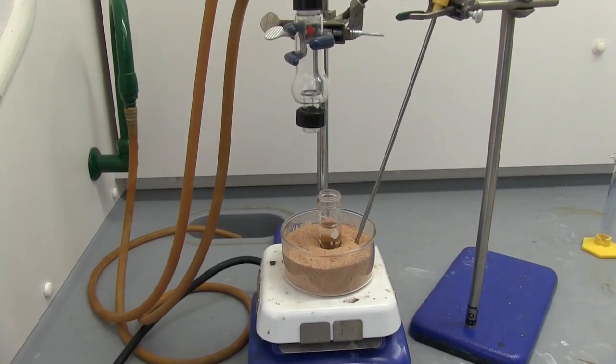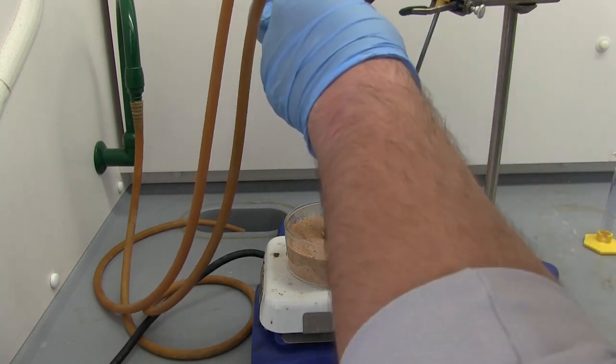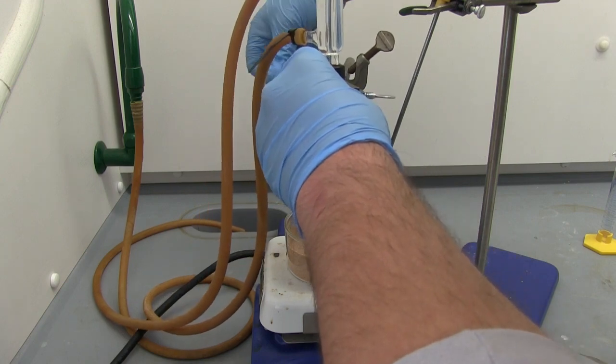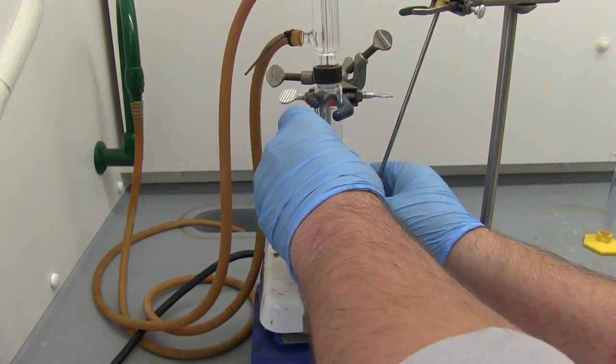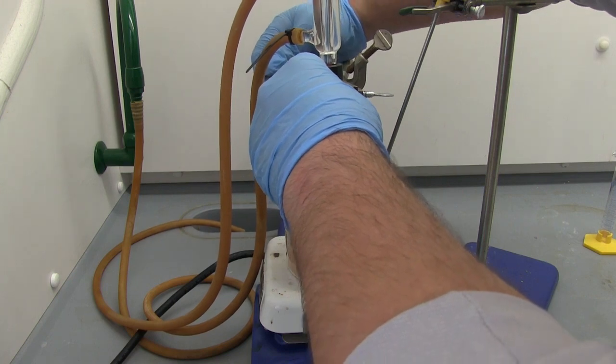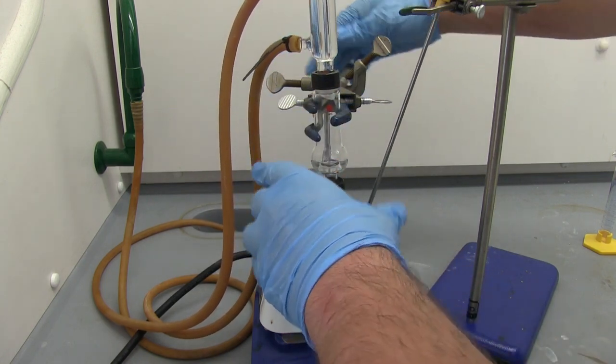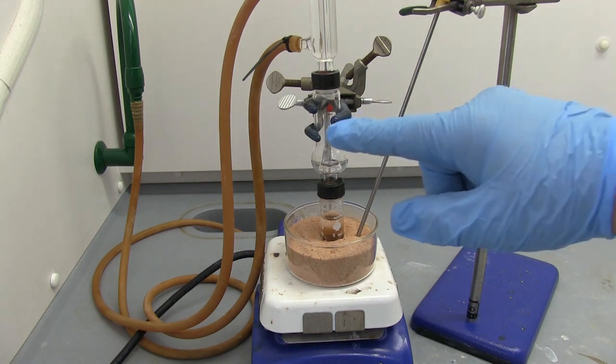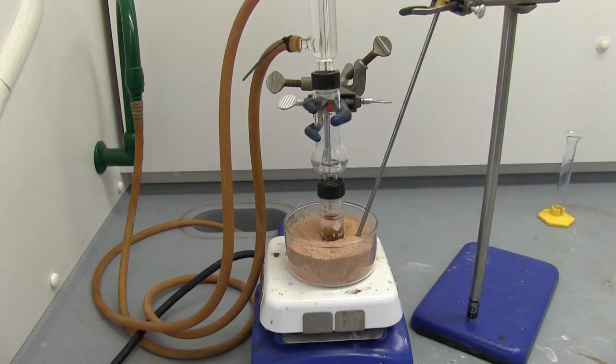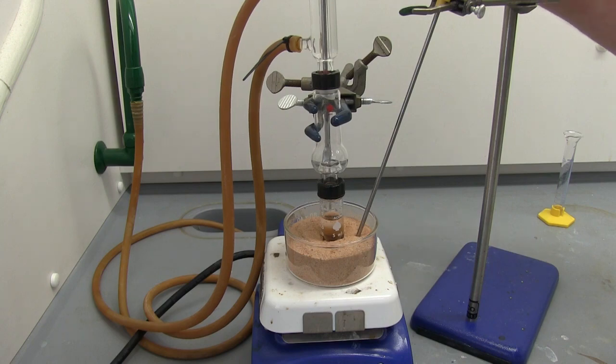Now that we have all our reagents in here, we're going to lower our distillation setup and get it all connected. Now you just screw in to secure it, and get it into the sand bath and connect up our thermometer. And we want our thermometer to hang out in here, the bulb tip of it, so that we're catching the temperature of the distillate, or the vapor as it comes out. So about there.